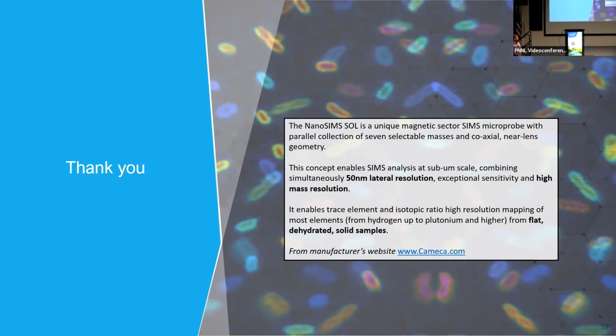We're ultra sensitive as well, so we can pick rare earths up, and we quite routinely do. I've worked a lot on geological systems in the past, and that's their bread and butter. Realistically, that's what this method was developed for: geology and cosmochemistry. So practically every analysis they do uses one of those weird elements of the periodic table you've not heard of.